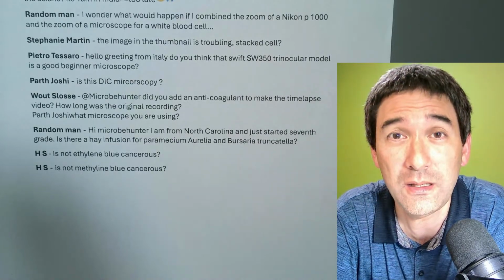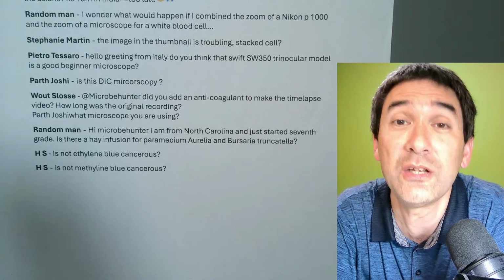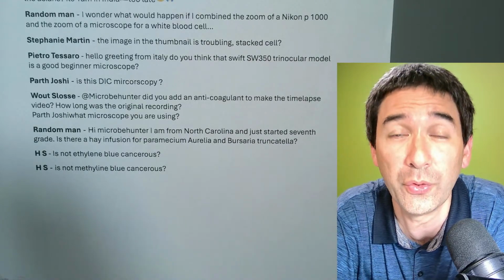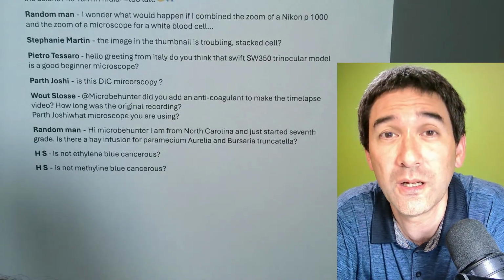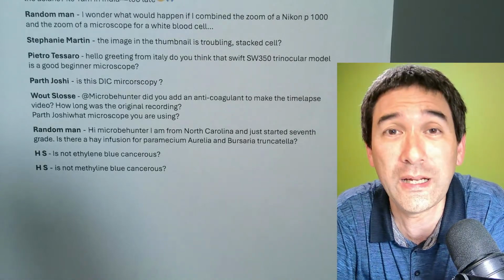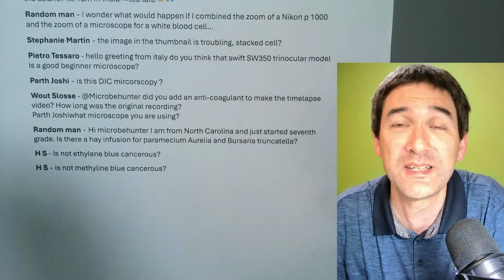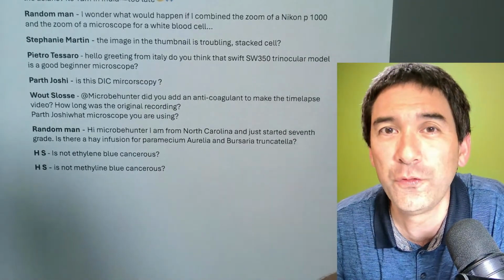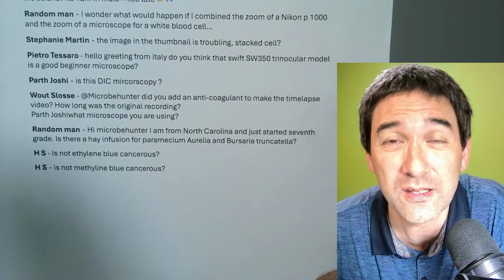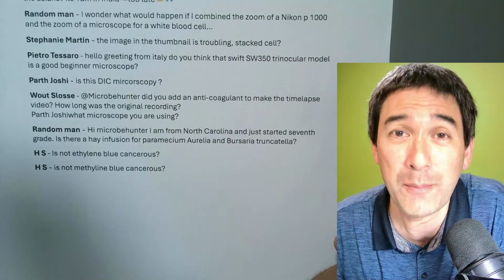And basically, what you then had, if you were lucky, and then you add some pond water to inoculate the whole thing. And then you had the growth of a whole range of different microorganisms in there. They called them infusoria, which is a collective term for vorticella and all sorts of ciliates. That's why they called them infusoria, in German Infusorien, as a collective term for all of these microorganisms, because they made it from a hay infusion.